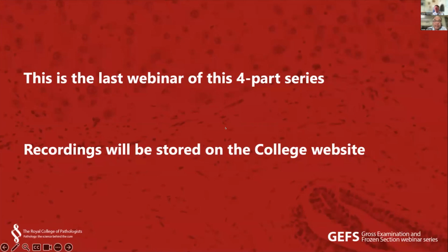Anyway, I have multiple questions from the candidates, so maybe I'll just read them out one by one. Yeah, sure. Are omental deposits and omental lymph node deposits to be considered the same? If not, then how do you differentiate on microscopy an omental deposit from an omental lymph node deposit with extranodal extension of tumor? Well, I suppose it's a good question.